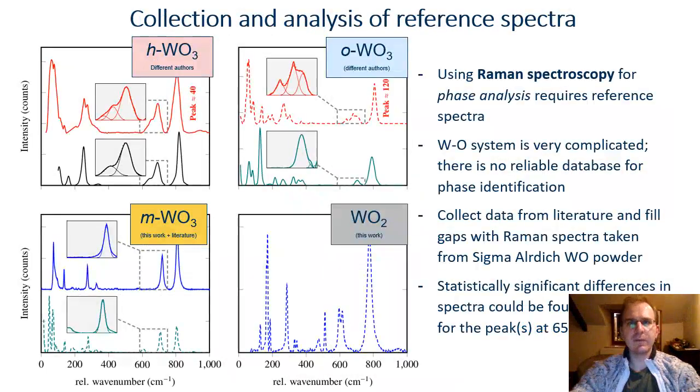At the time of the analysis, we did not have a collection of reference Raman spectra for the different oxides, so we had to manually assemble this collection.